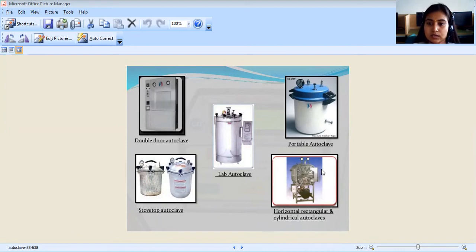Okay. So, next, limitations: safety, environment, cost, and equipment. So first, safety. A very high pressure environment, and autoclave cracks or leaks can scald the autoclave operator, and an industrial autoclave can operate at an even higher temperature.